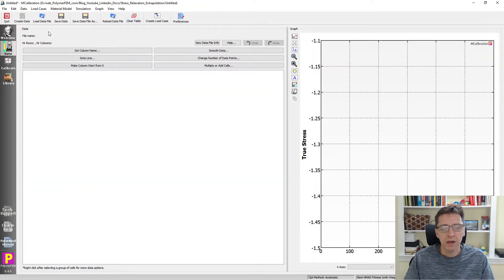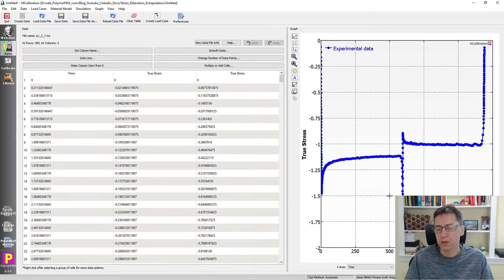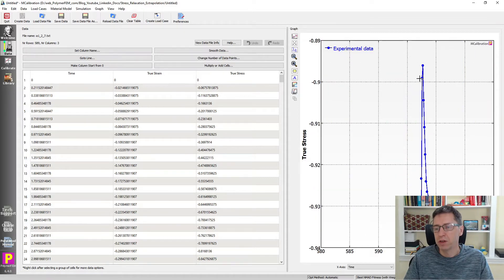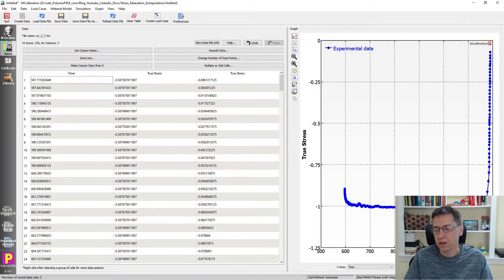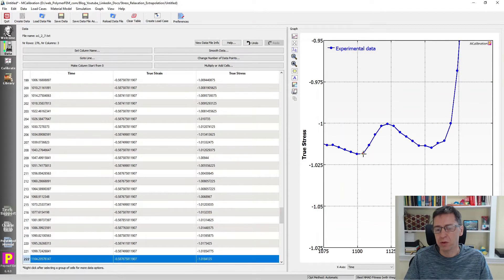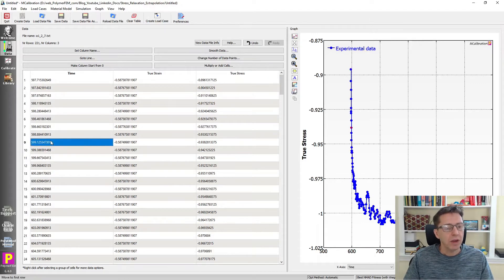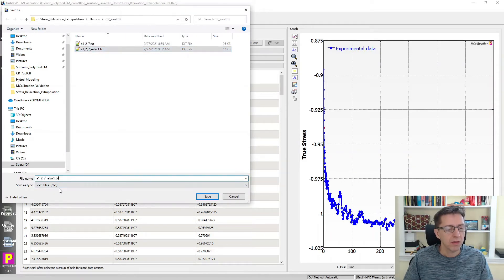I'll also extract the data for the second relaxation segment, so I'm going to load in the original file again. I'll plot time versus stress again and extract the results in this portion. I'll zoom in a bit to figure out which data points to remove, select them using Ctrl+Shift+Up Arrow, and delete. One thing I want to do is make sure these files start with zero time, so I'll make this column start from zero. Then I'll save this file as relax2.